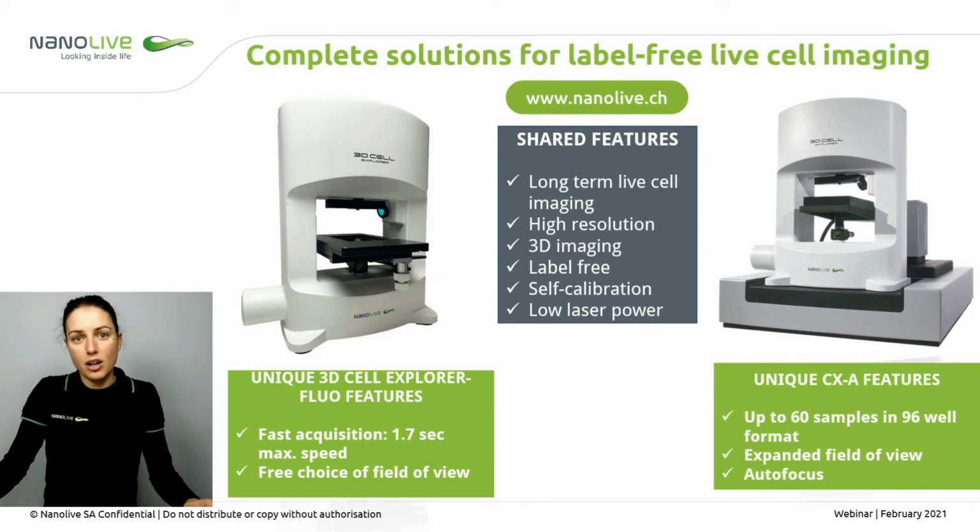They normally have longer mitochondria that are thinner because they're more metabolically active. And the second part of the question was about contact points. Yes, the resolution of our microscopes is such that you can clearly see the contact points between lipid droplets and mitochondria, which allows you to look at how the two are distributed throughout the cell cytoplasm.